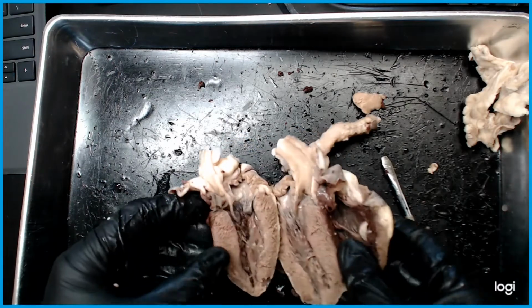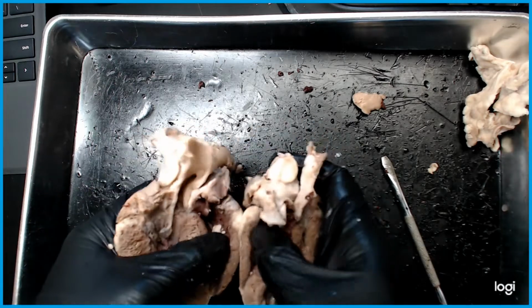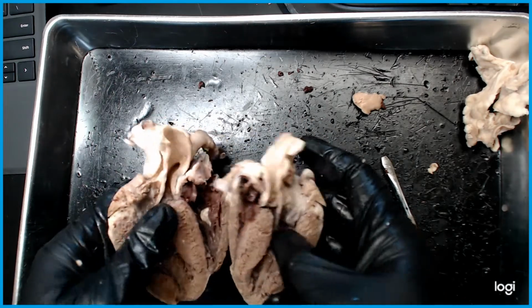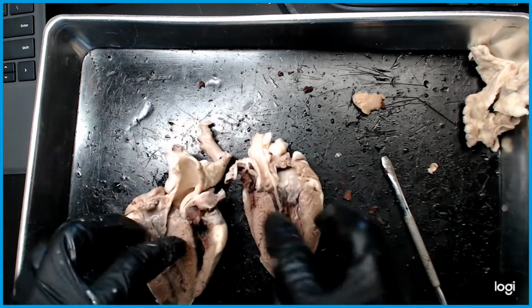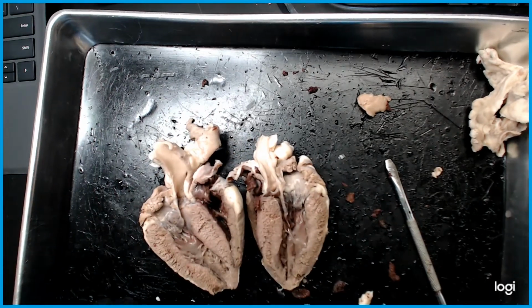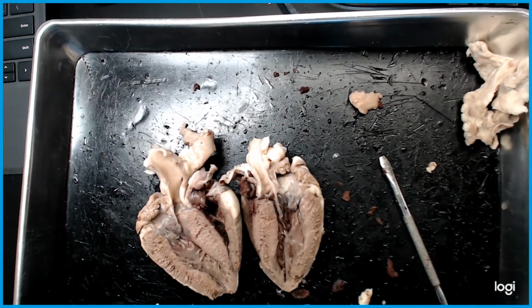There it is. Let's place it like this. Right side of the heart, thin side, right? And then the left side of the heart, much thicker chamber, or walls of the myocardium, sorry. There it is.